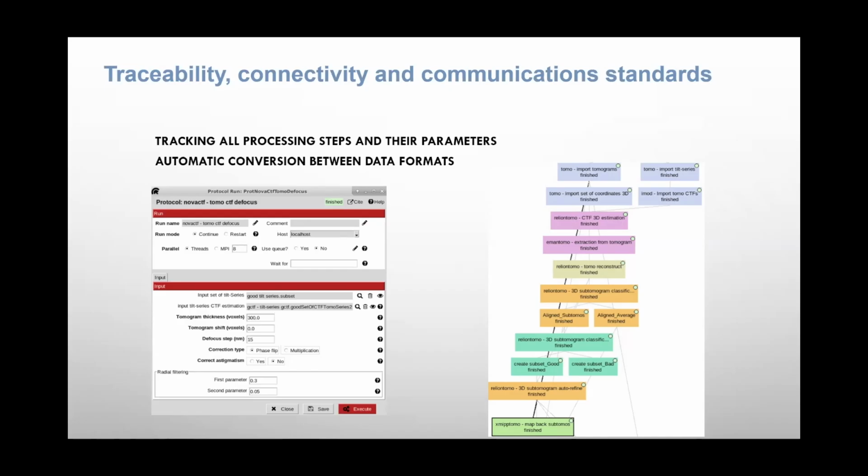Instead of executing a command line, you have a graphical interface with the same parameters and exactly the same entries as your original interface. If you open Relion and you open Scipion, you are using exactly the same version of Relion and the same parameters of Relion. So it's nothing different. What changes is the graphical interface.